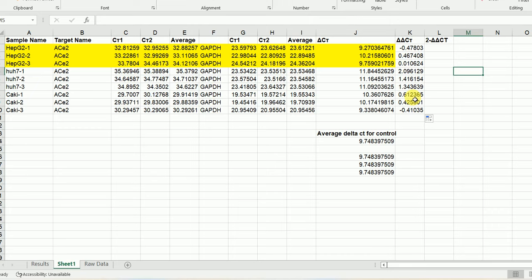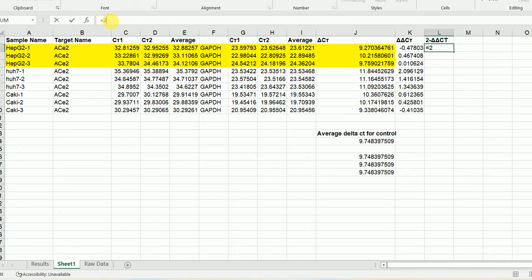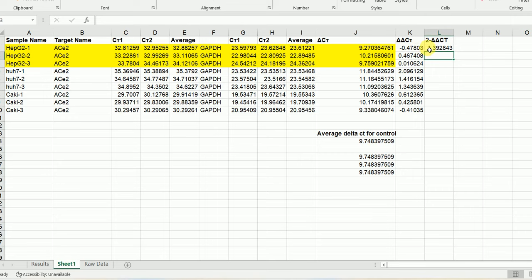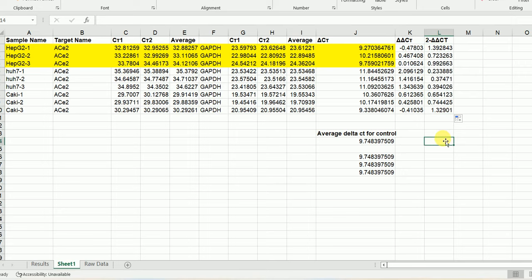Now we have calculated the delta-delta Ct value. I'll show you how to calculate 2 to the power of minus delta-delta Ct. We use the formula: equal sign, then 2, then the power sign, then minus, and then select the delta-delta Ct value, and hit enter. Then I'm going to drag everything down. This gives us all our 2^(-delta-delta Ct) values.